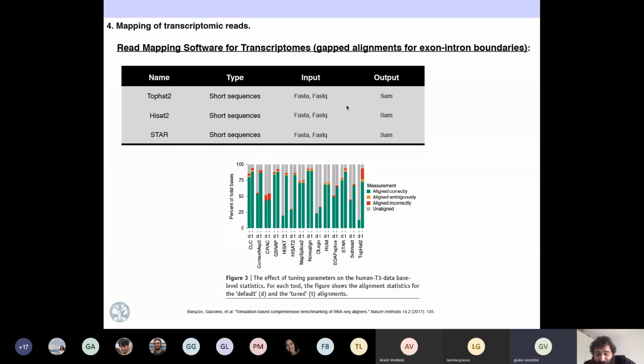That is a really good question. So you have some parameters, and some not others. One of them is experimental parameters. As you can see, when you are tuning, most of the time what you do is increase the number of aligned reads. The thing is, you don't know if you are aligning correctly or incorrectly, but you can increase the number of aligned reads.